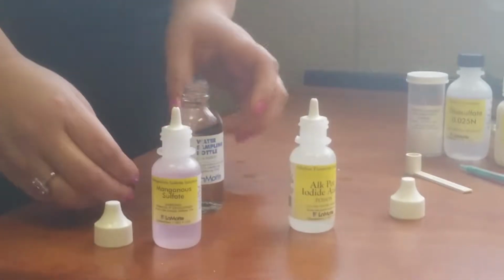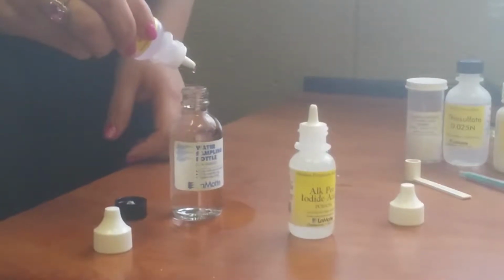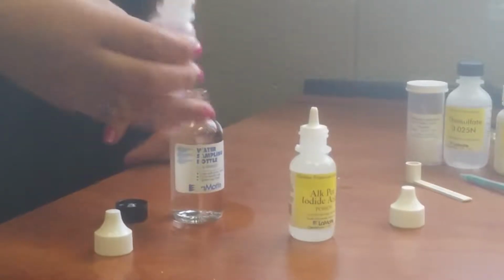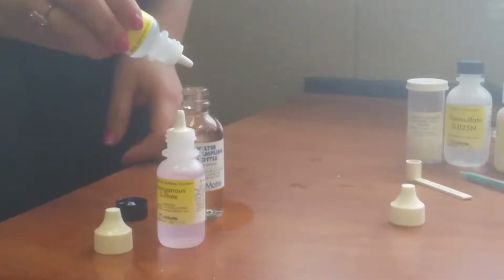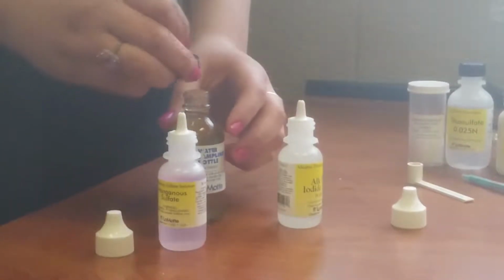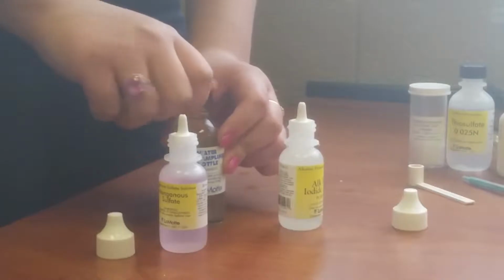We will then uncap our bottle and add 8 drops of manganese sulfate solution. We will then add 8 drops of alkaline potassium iodide. We then will cap our solution and mix.